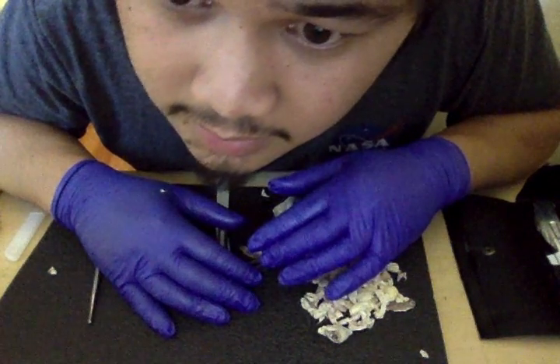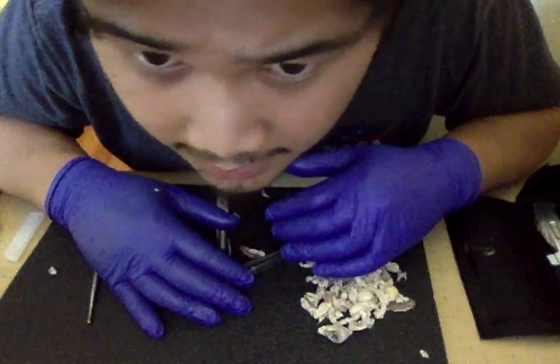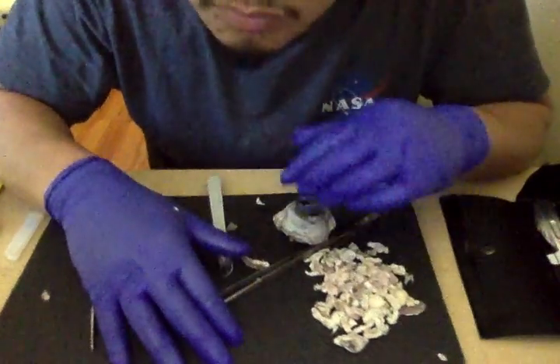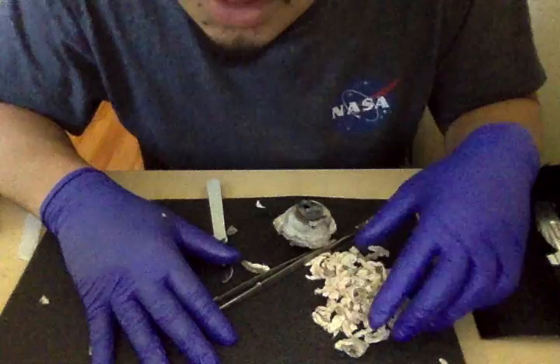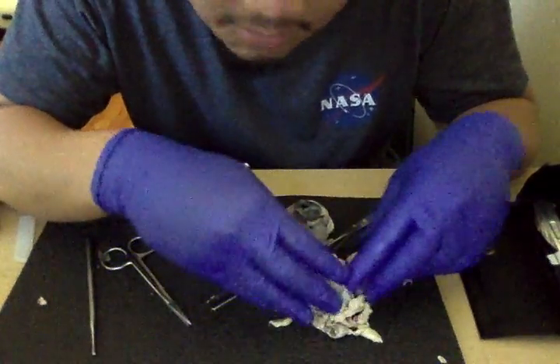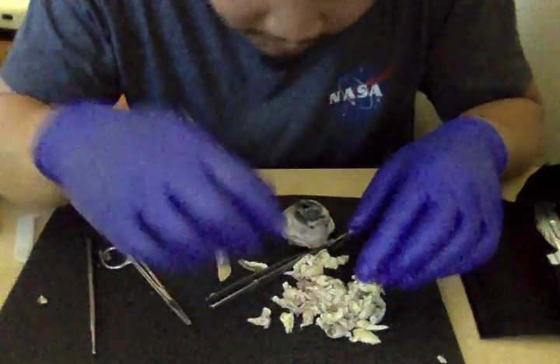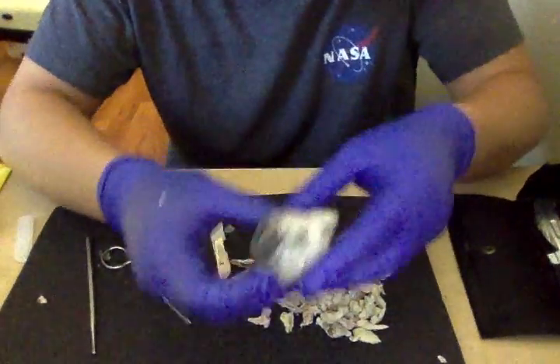Hi, my name is John Paul Vergara and this is Week 8 Lab: Dissecting the Eye of the Cow. I already removed all the fatty tissue because if I don't it will take me more than 5 minutes. So here is the eye of the cow.